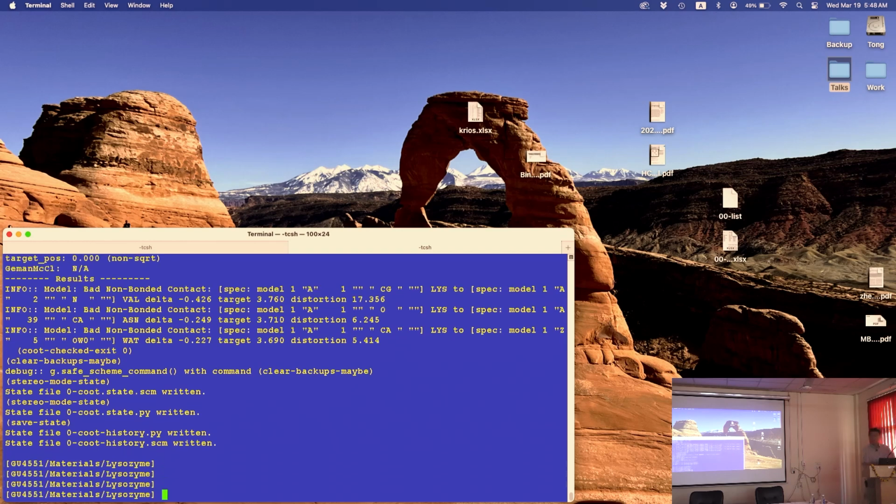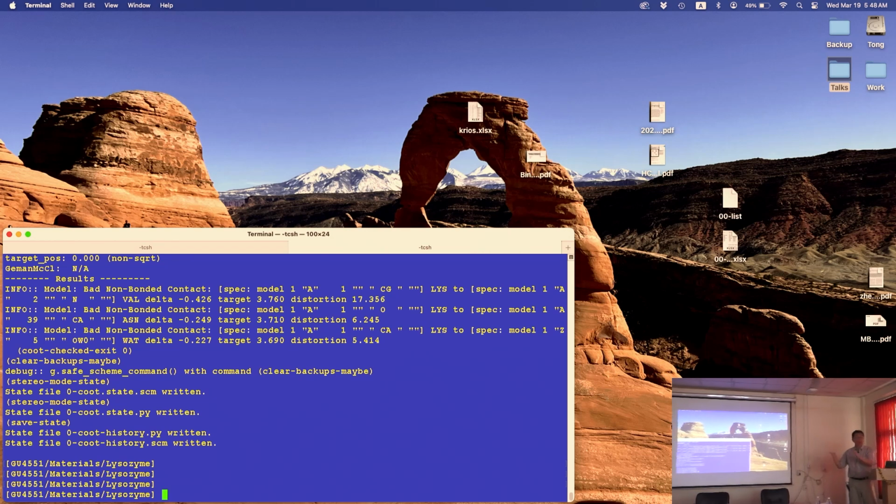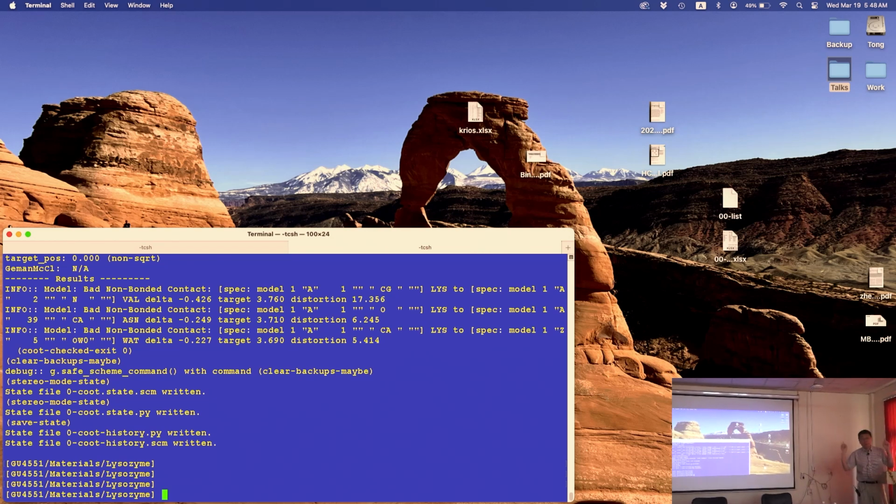Okay. All right? Everybody, please have a clean slate. Let's start at the same place. Hopefully you end at the same place. Please pay attention. I'll slow down. Every step I will wait for you to say yes or no. Okay? So start Coot.